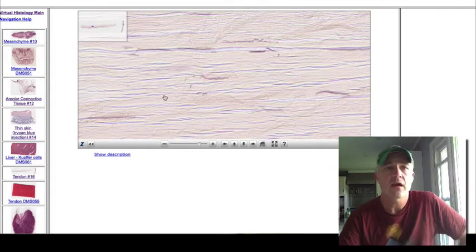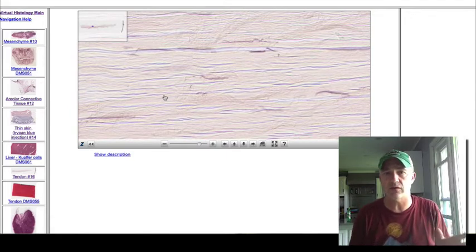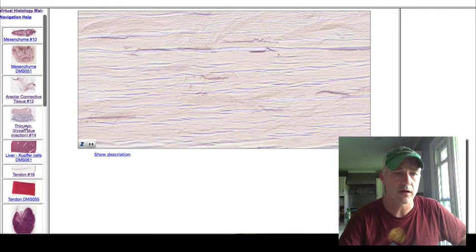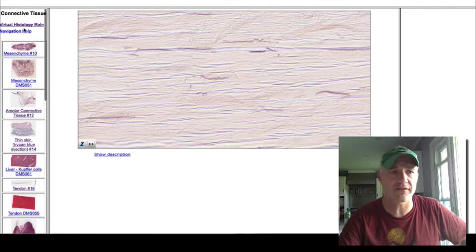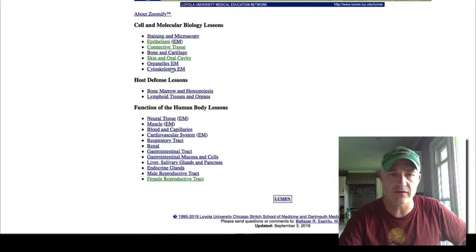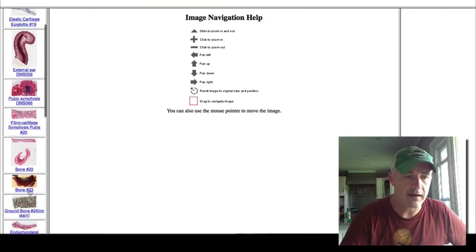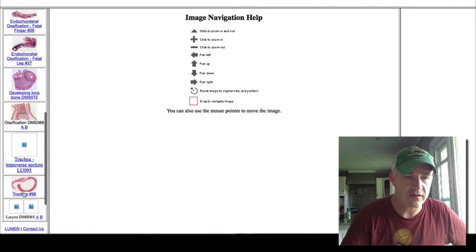So those would be, to me, all your connective tissue proper types. Outside of that, on the next one we'll take a look at the three different types of cartilage and bony tissue, and then maybe muscle on that one also. In fact, I think we're short enough on this one right now that I will actually go to bone and cartilage and take a look at some of these as well. So to start with, we're just going to go to the trachea again.